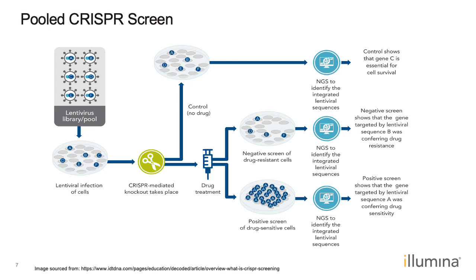Now, a critical component of a CRISPR screen is the transduction step, and it is crucially important to ensure that you only have one virus per cell, and therefore only one guide or knockout per cell. In order to do this, you're going to use what we call a low multiplicity of infection, or in other words, you're going to use an excess of cells that will not actually end up getting transduced. So we will also have wild type cells in the mix as well. And this is very important as, again, we want to make sure that what we are observing is from a single knockout and not from two cells with two or more targets or genes knocked out in them.